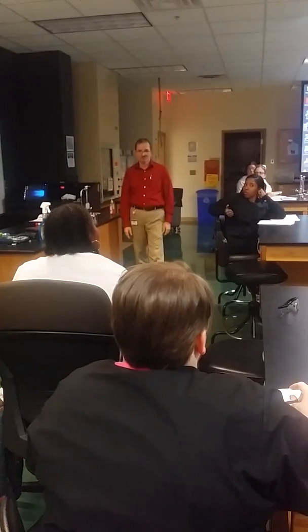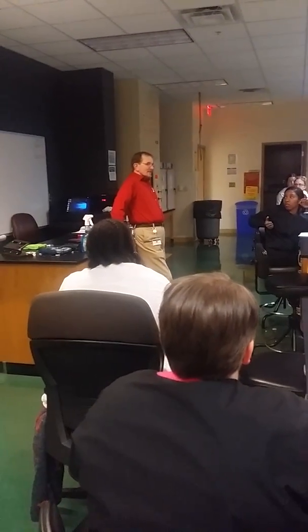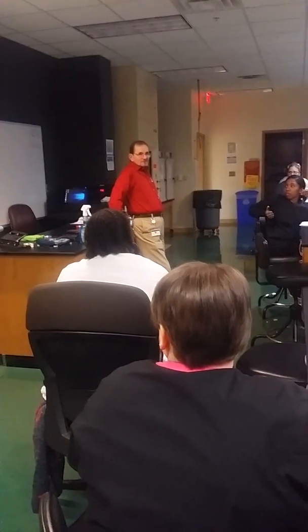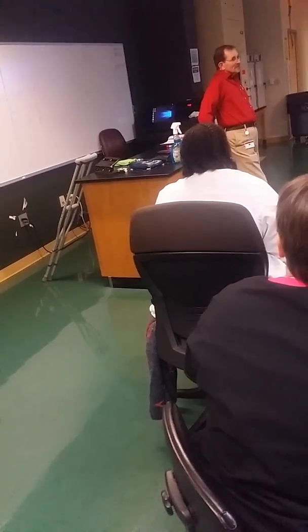Okay. So Wednesday we're just making the culture. Wednesday, you're taking them out of the test tube and putting it on a plate. Not a lot to that. Right. Starting next Monday is when you gotta go to work.